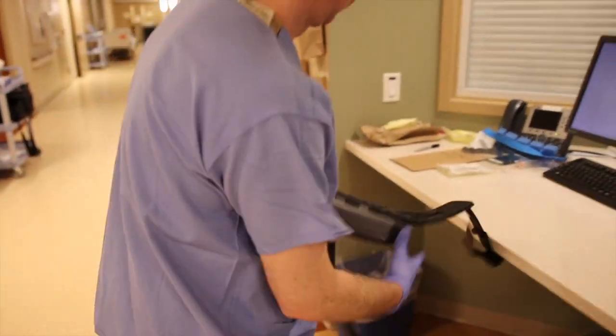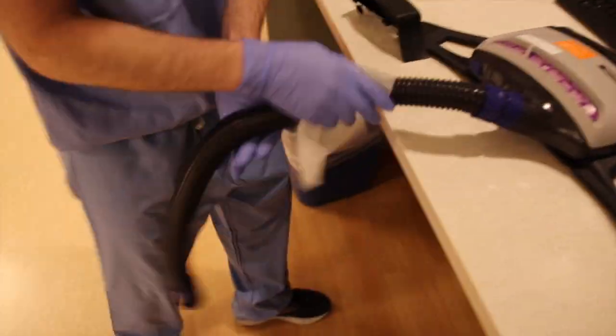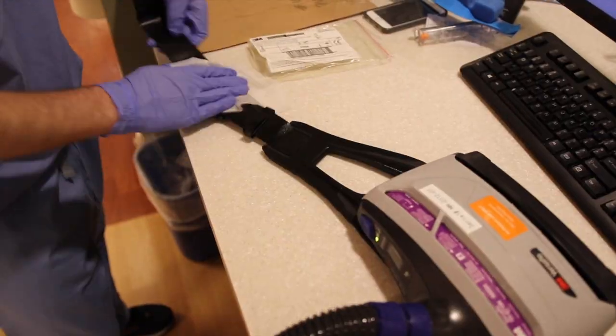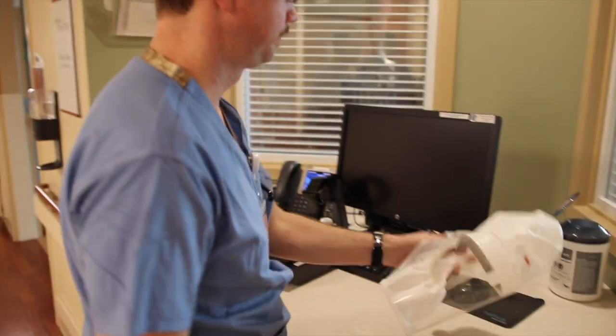Next, you can remove the PPE and clean it thoroughly using sanitizing wipes. Ensure that you have not missed any spots on the PPE before you put it away for future use. Remove your last set of gloves, wash your hands, and then store your hood for future use.